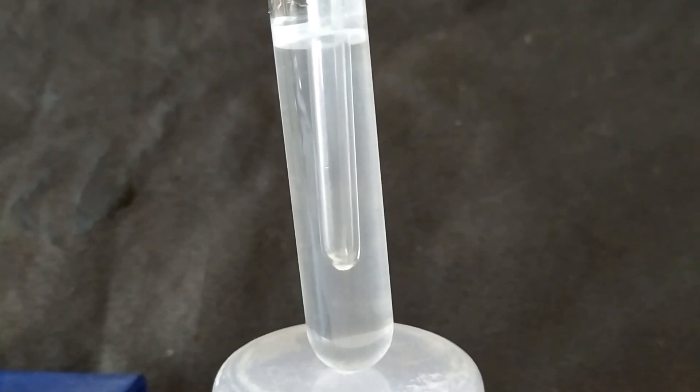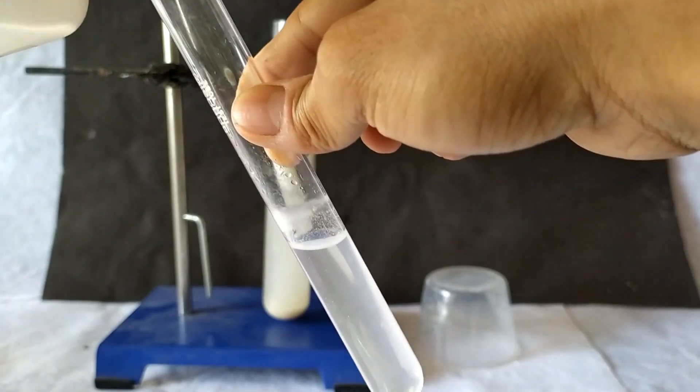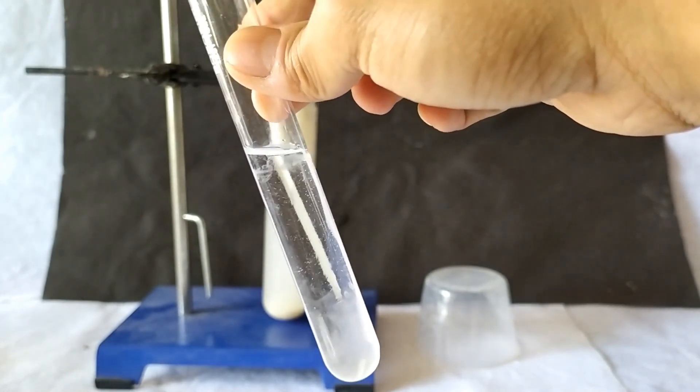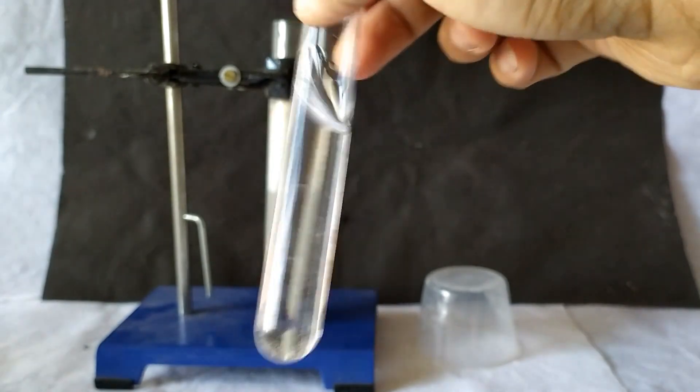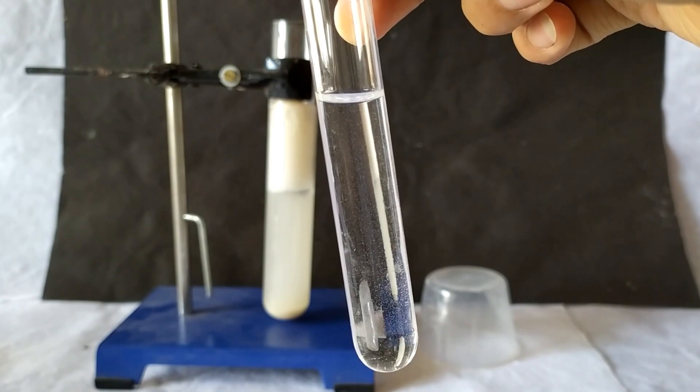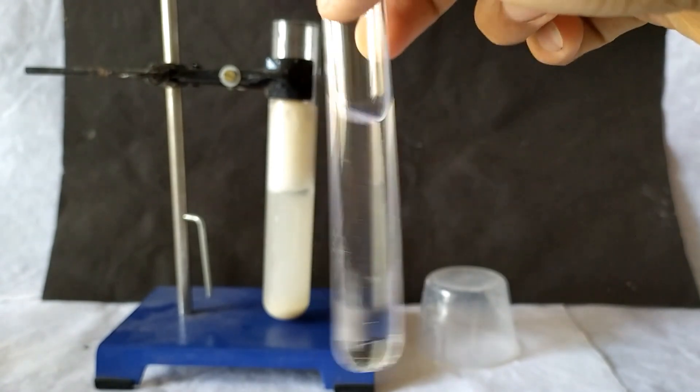At this point, disassemble the setup. First take the tube containing lime water and add 1% hydrochloric acid drop-wise to the tube and shake gently. The cloudy white precipitate dissolves completely, suggesting that the white precipitate is indeed calcium carbonate, which is a product of the reaction between carbon dioxide and lime water, which is calcium hydroxide solution.